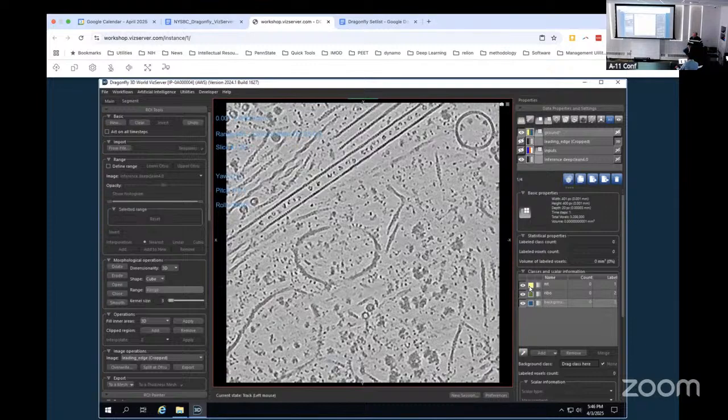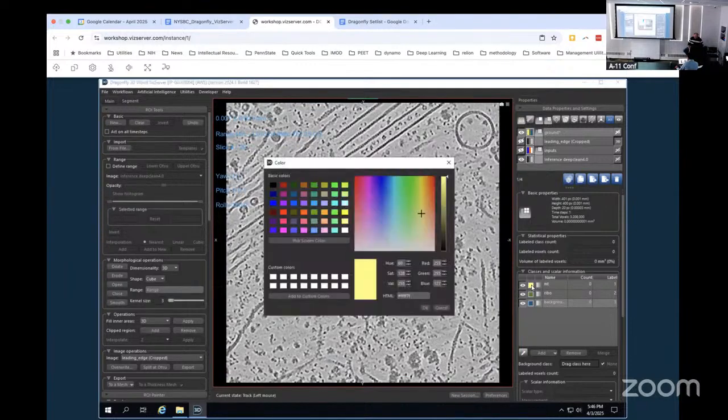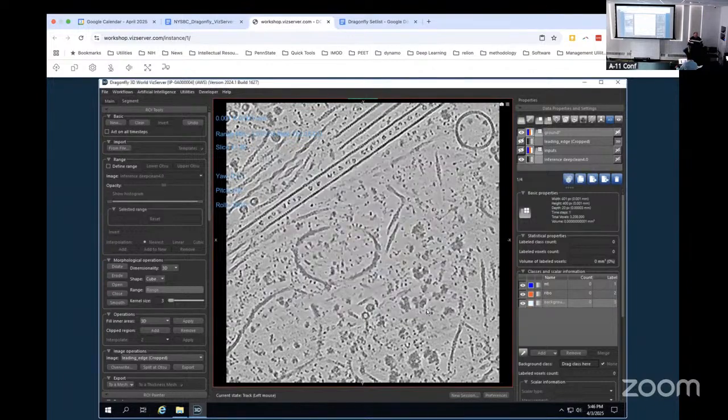So right here, you can just pick a color from the palette that you like. It doesn't really matter. I always go dark blue for microtubules, orange for ribosome, and I like to use white for background just because it's the least obscuring of the view behind it, but none of that matters. So let's try. Does everyone have a multi-ROI open called ground?